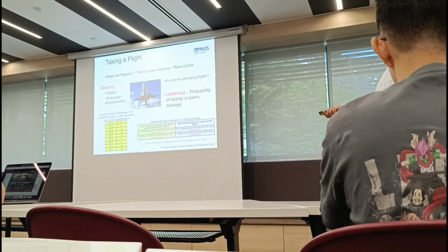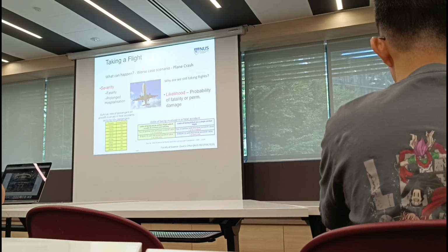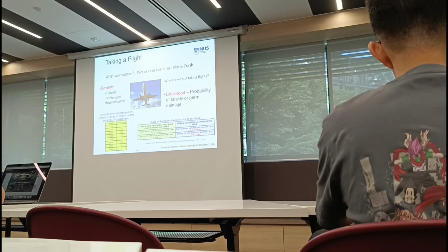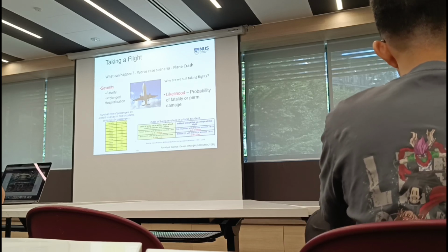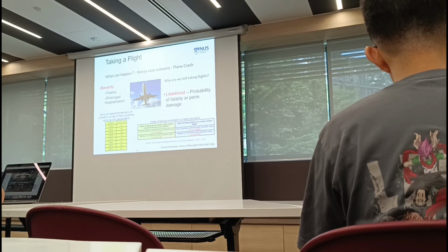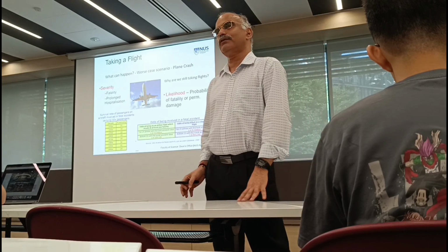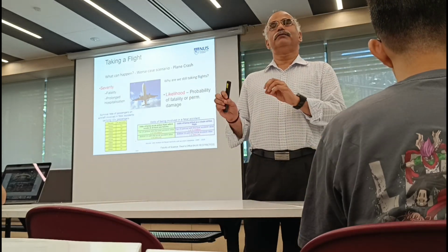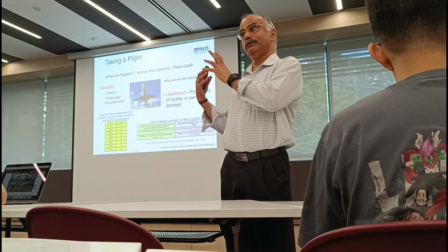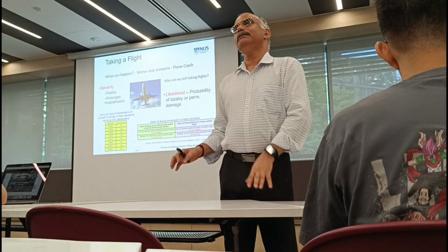It depends on conditions. In the earlier years, the 1930s, there were some incidents. By 2000, it has become less and less, right? The odds of being involved in a fatal accident are 1 in 5 million, something like that. So the number of incidents is very low because of the safety precautions. So likelihood will be a very small number. Even though severity is higher, severity could be 3, but likelihood is 1, right? So 1 times 3 would still be okay.